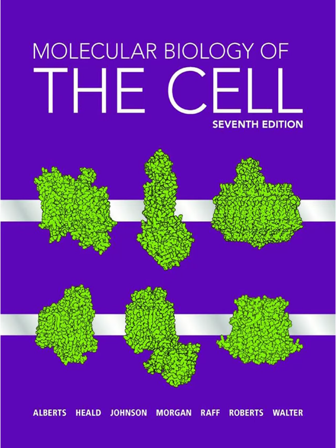And you can use different colored dyes for different proteins in the same cell. Yes, that's a huge advantage. You can label protein A green and protein B red and see if they are in the same location or different compartments. It's fantastic for comparing distributions. Is the signal always strong enough?